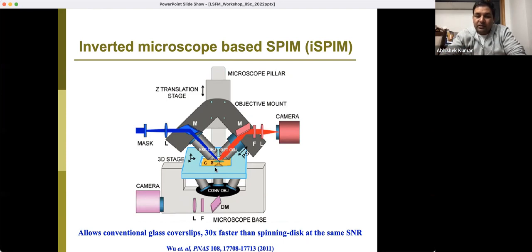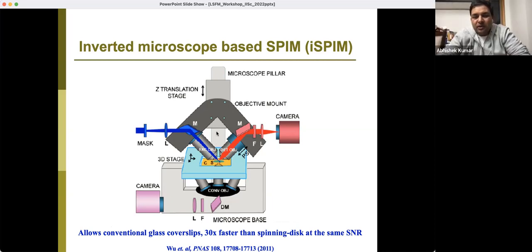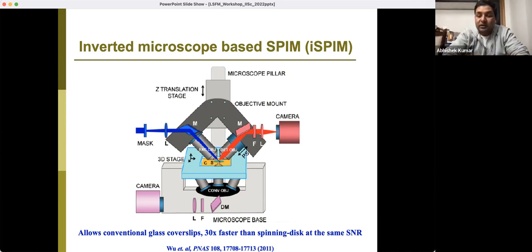But later on, as I showed you, a 3-view system. Basically, we use this lens, we put a high NA lens and a better camera to capture 3 views and fuse them together. So it's just for ease. Thanks, that's a good point. The idea is to show you that you can mount all these things in a different way, and depending on what information you want to extract, you can utilize them accordingly.